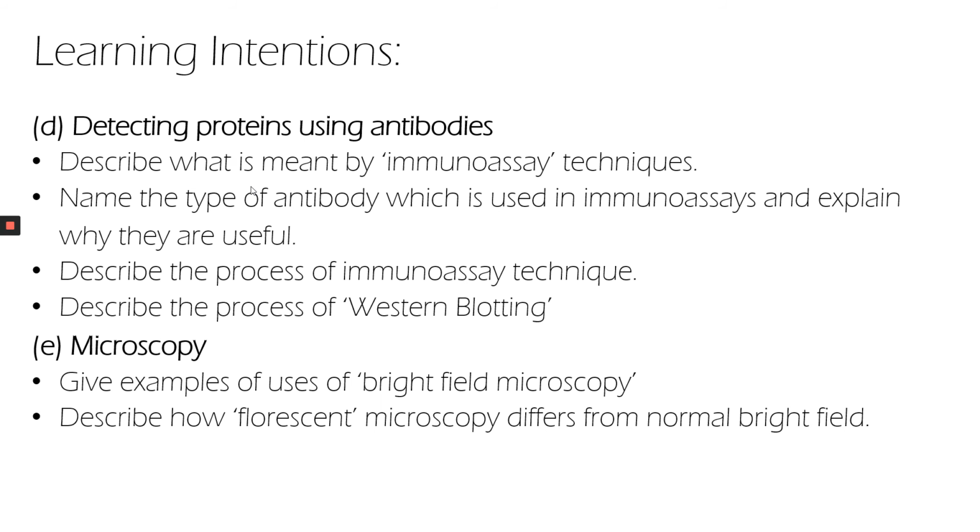So that's all that's in this section. So we've looked at immunoassay techniques and the fact that they're used to identify specific proteins. These techniques use a stock of antibodies with the same specificity, which are known as monoclonal antibodies. An antibody specific to the protein antigen can be linked to a chemical label. The label is often a reporter enzyme, which produces a color change, but we could also have chemiluminescence, fluorescence, and other reporters. In some cases, the assay uses a specific antigen to detect the presence of an antibody.